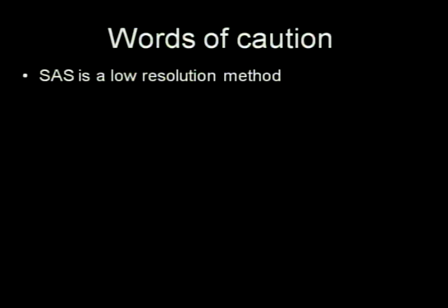However, when you do modeling against SAXS data, you need to keep several things in mind. So first of all, SAXS is a low-resolution method. Even when you use high-resolution models, when you do SAXS modeling, the resulting model is still low-resolution, even if it looks different.